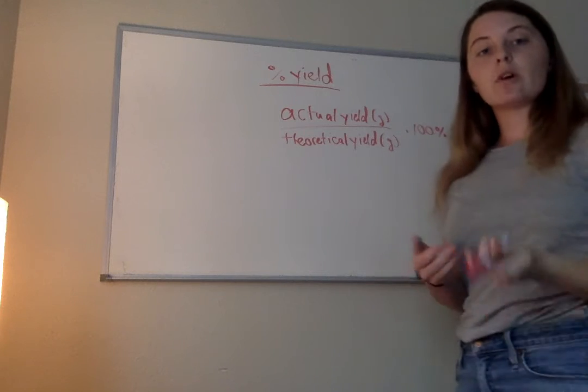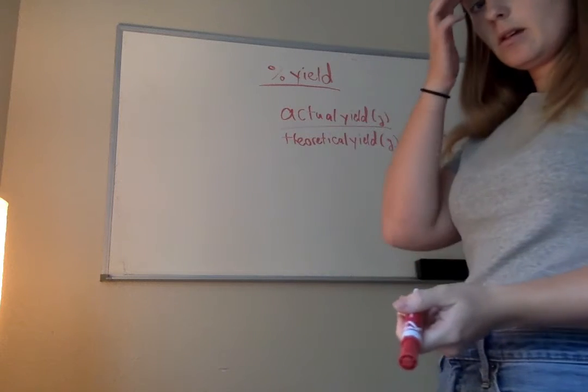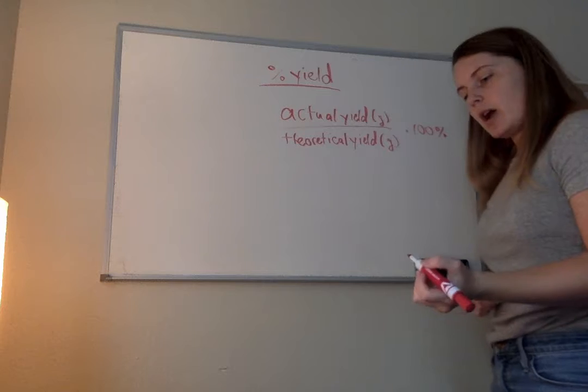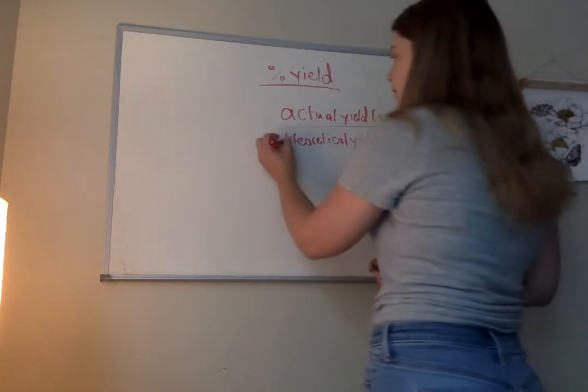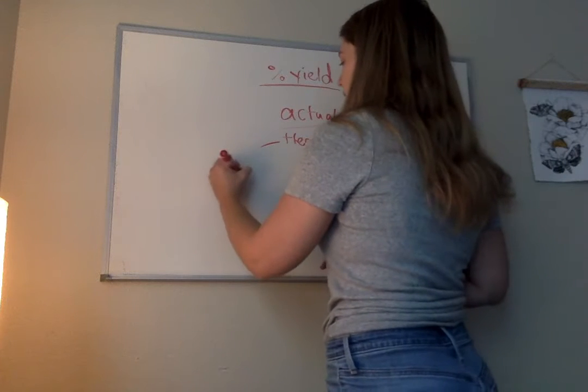And since we're going for a percentage, we always multiply by 100%. Okay, and so the theoretical yield is not the same as the grams of cyclohexanol.